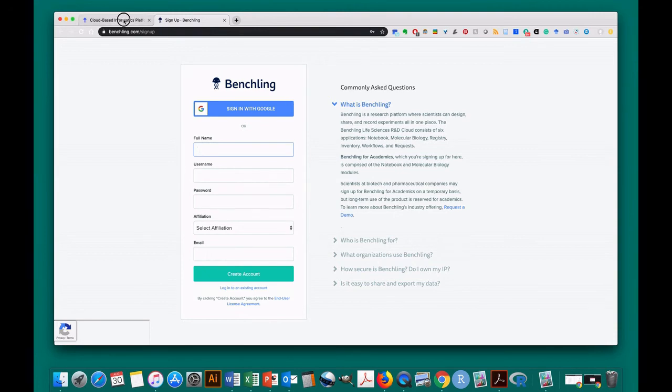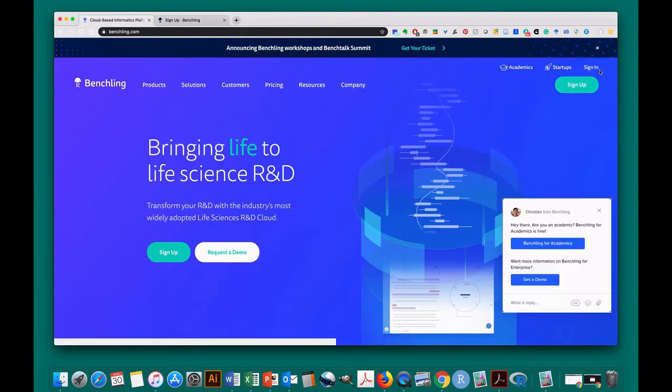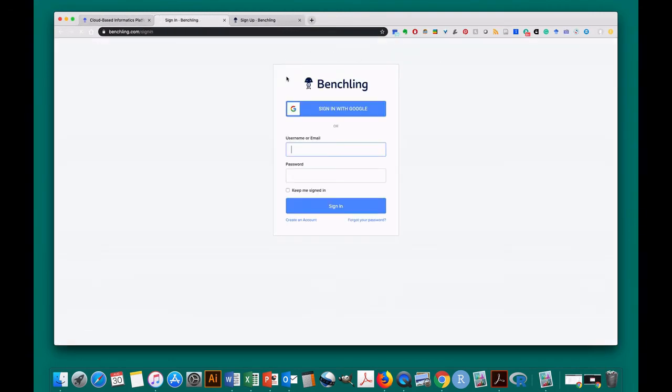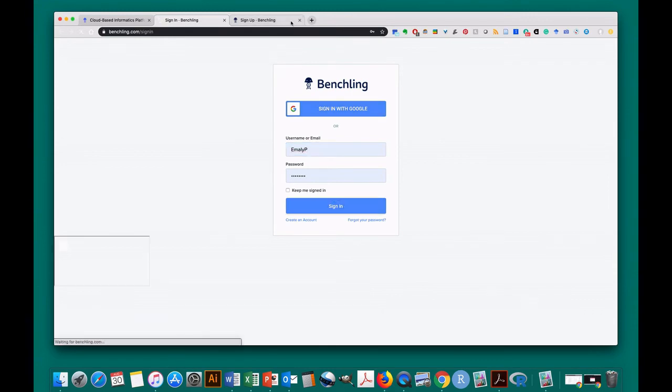Once you do, you'll sign in and the landing page looks like this. And this is the cloud-based visualization platform we'll use.